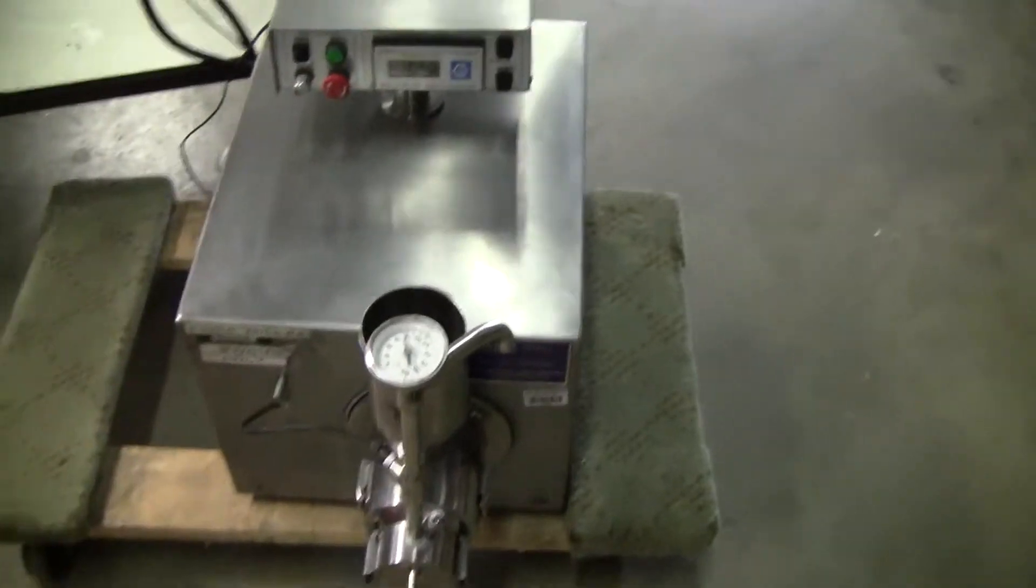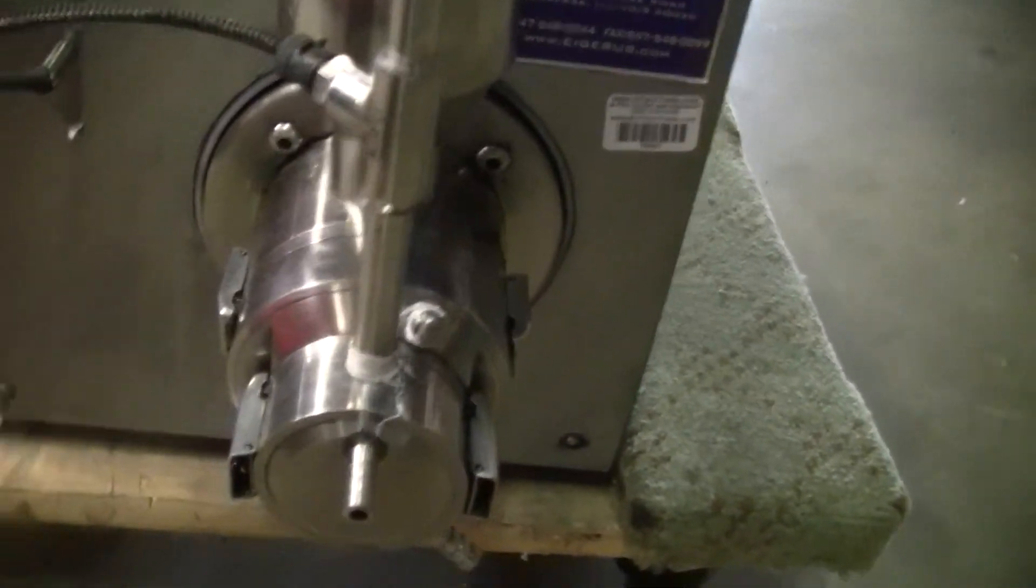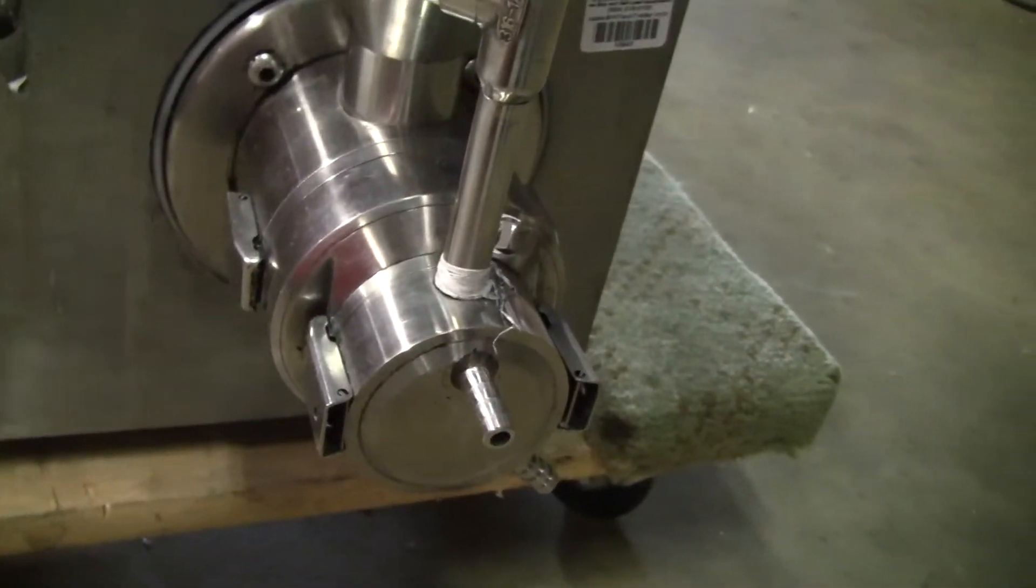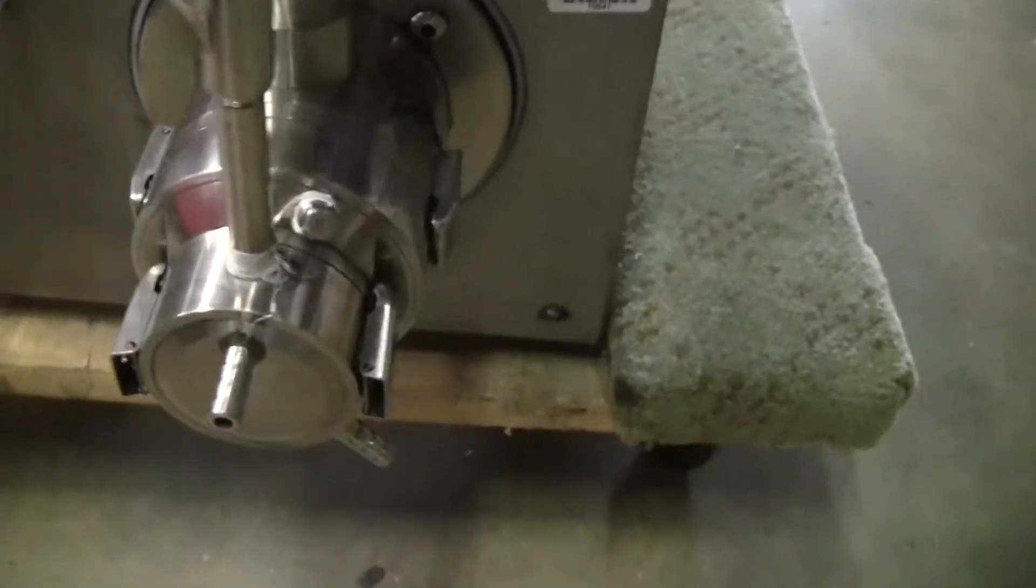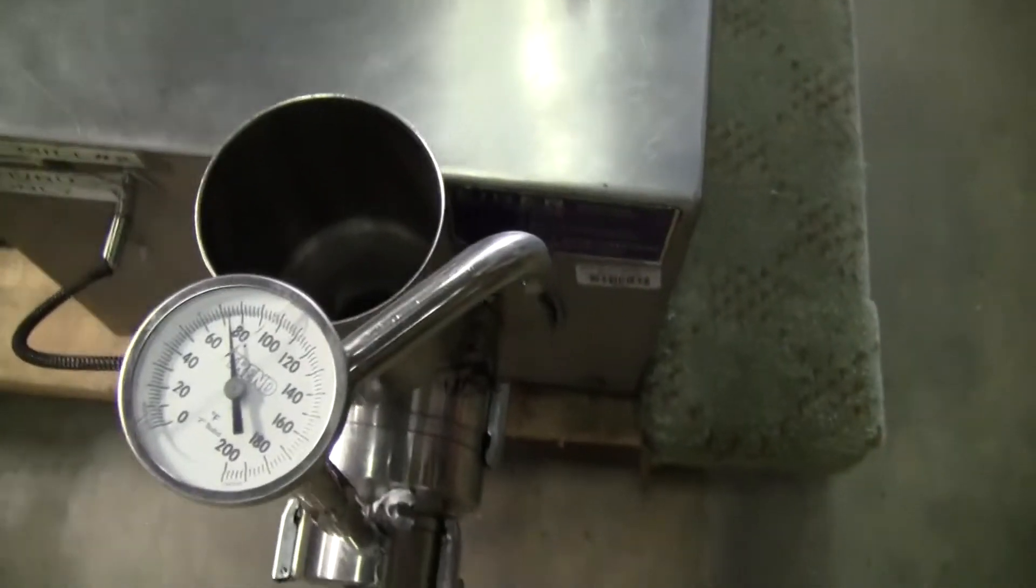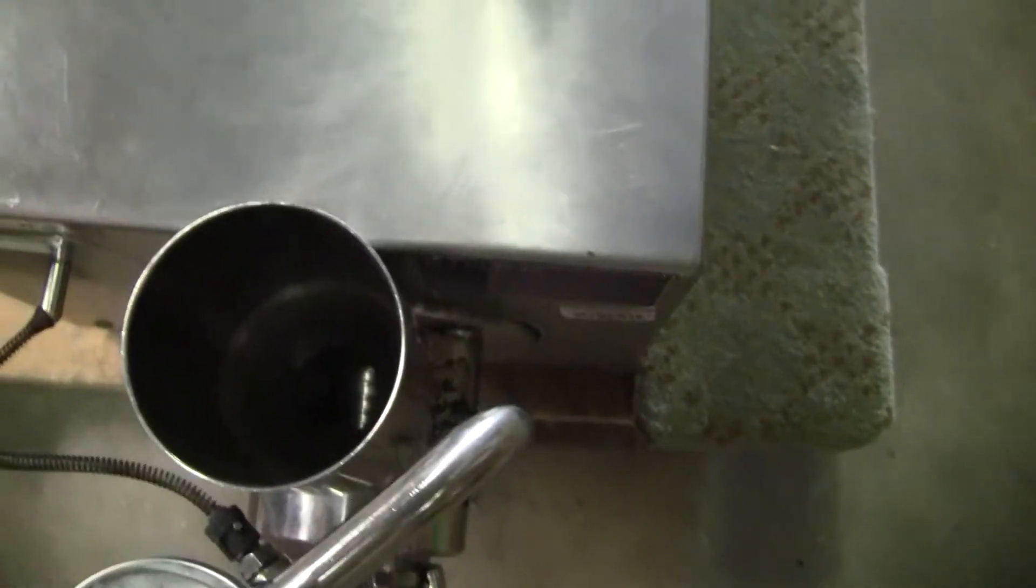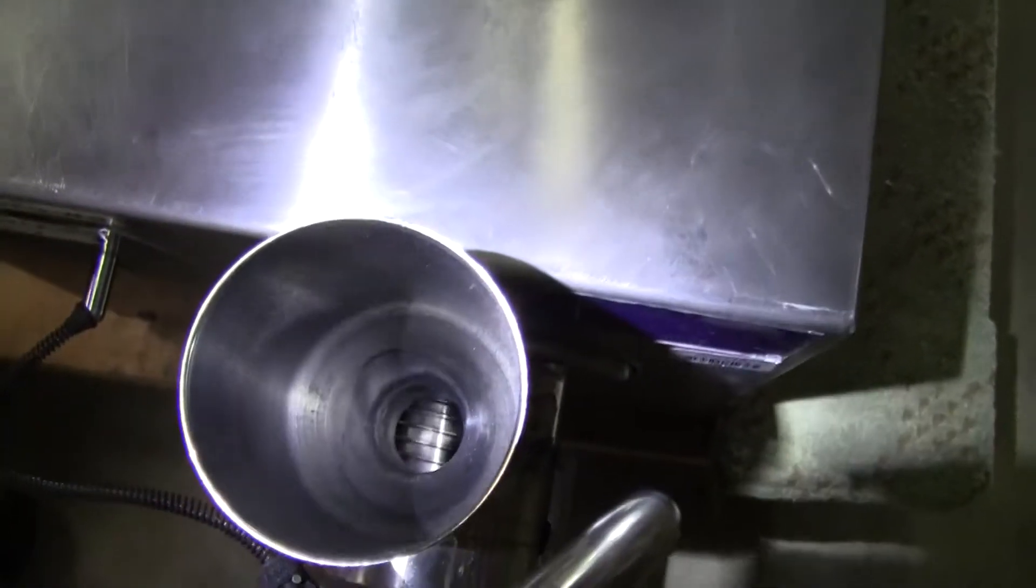Let's take a look at the head configuration. Temperature gauge up top. And you can actually see it inside.